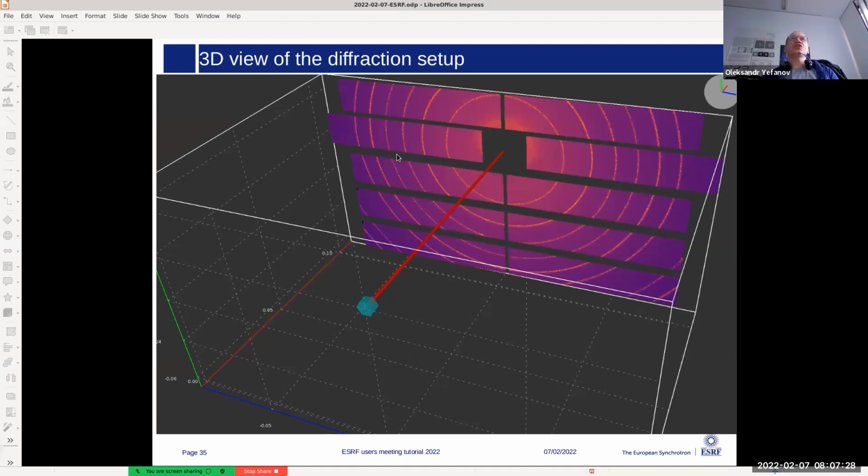But if you change the physical geometry of the detector, for example, you incline one panel, how can you modify your geometry to take this into account? Basically, you cannot. This detector has no translation stage.